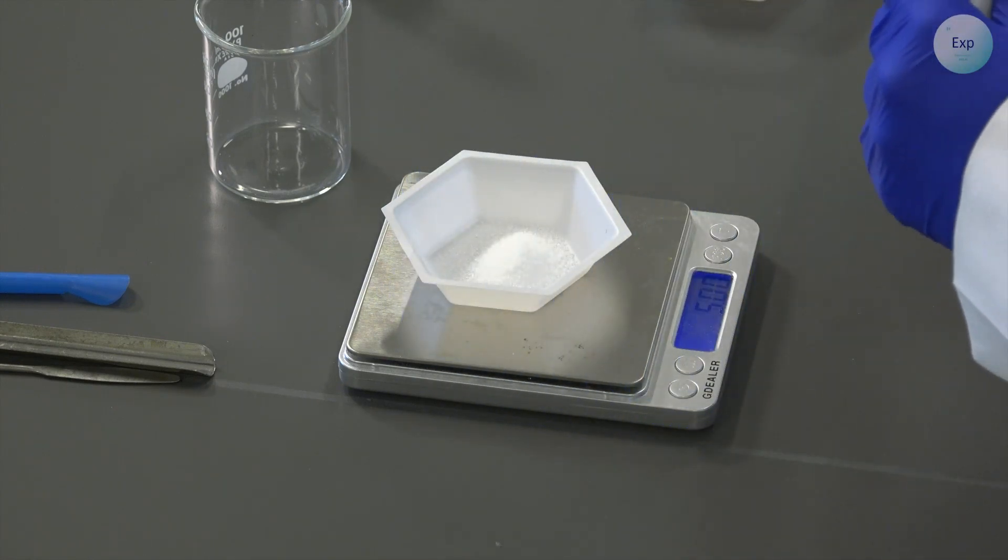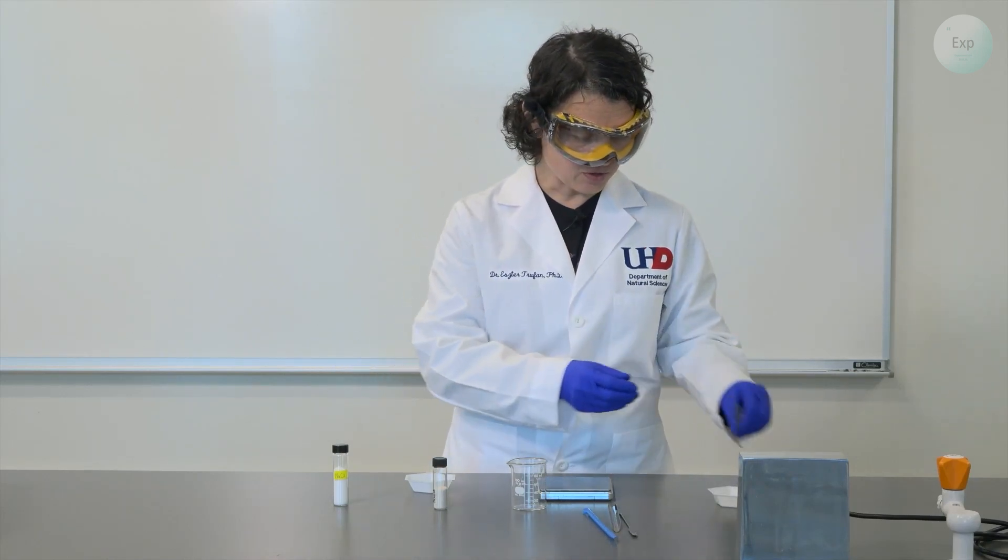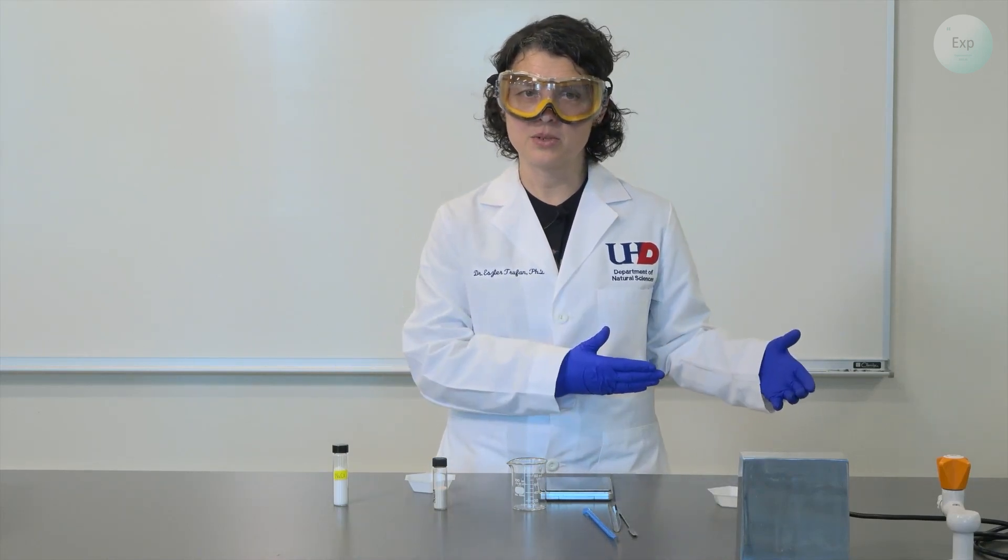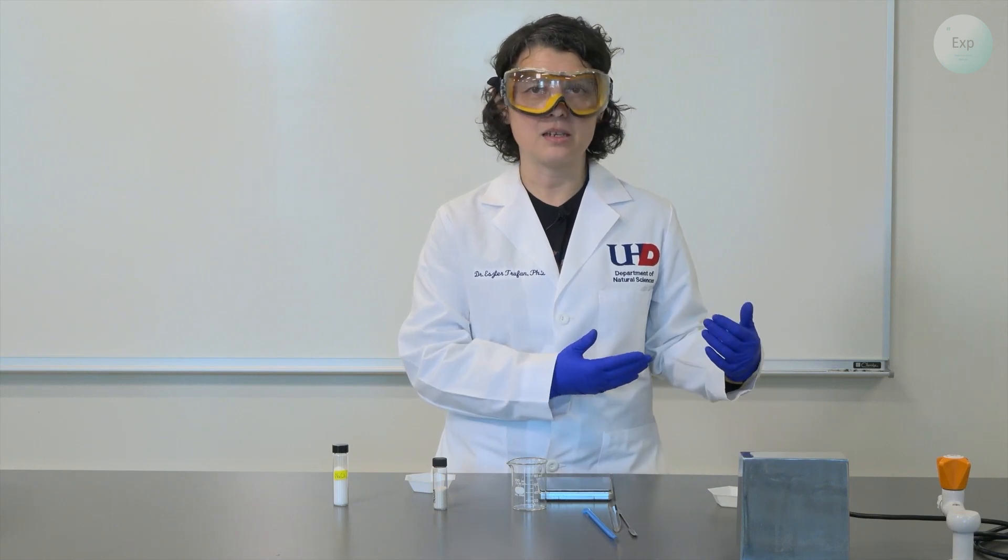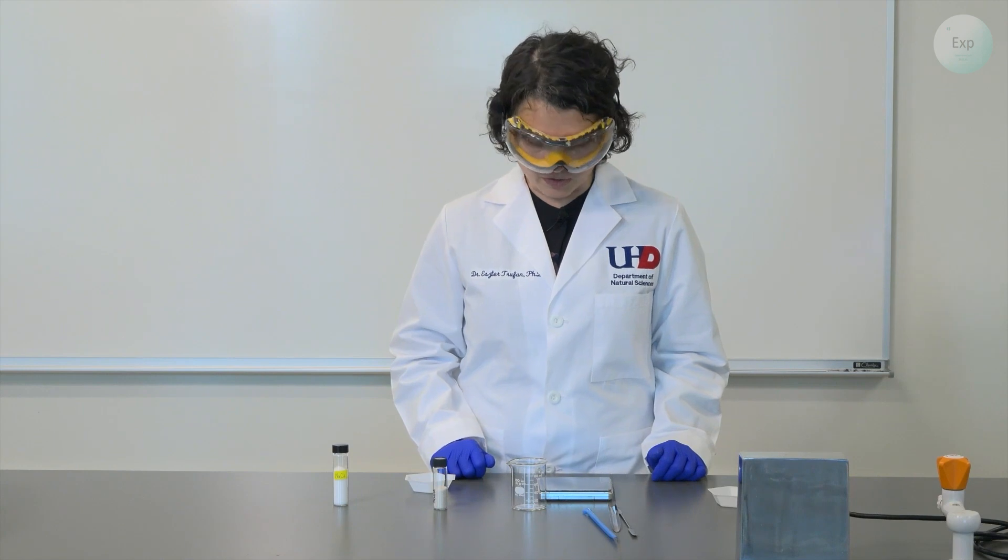I have 5.00 grams of sodium chloride in my weighing boat. I will set this aside and also set my spatula aside because I contaminated it with sodium chloride. So at this point, I can either wash it and dry it, or switch to a clean spatula or scoopula.